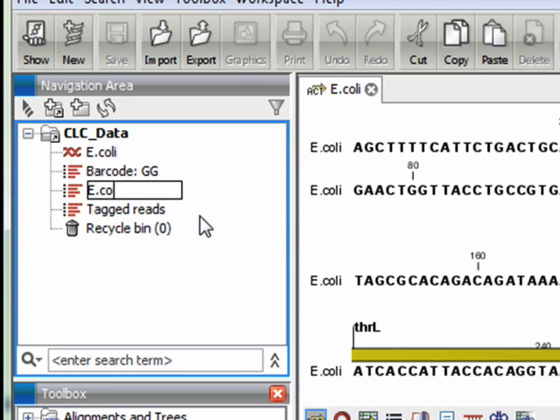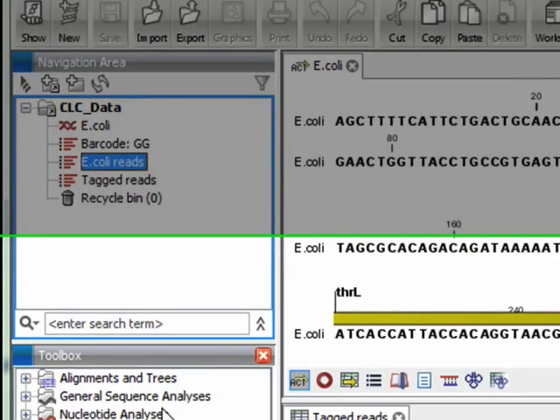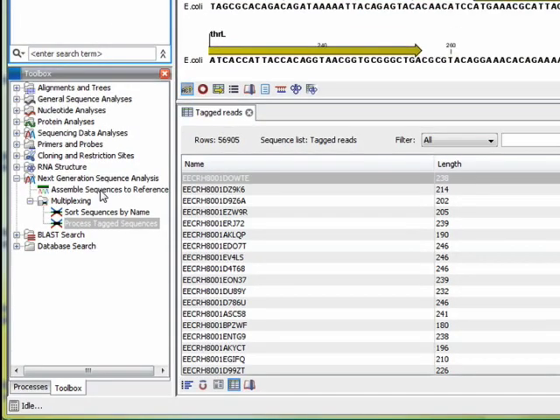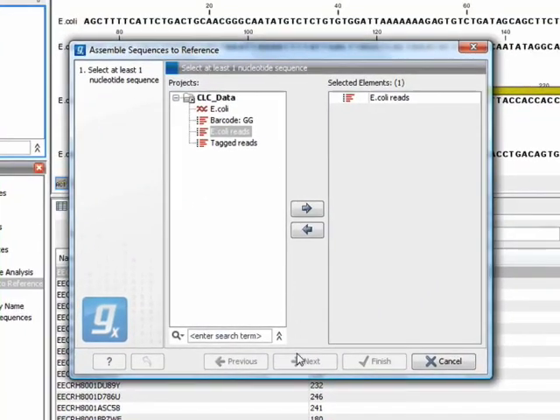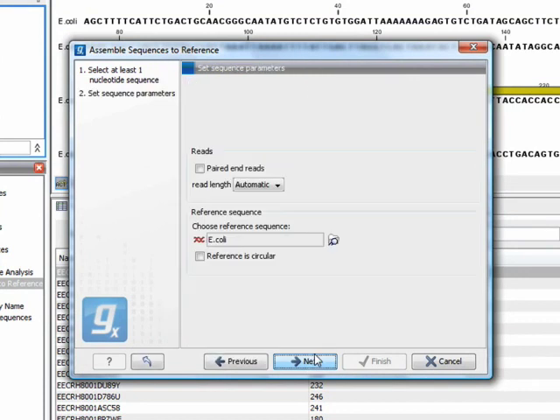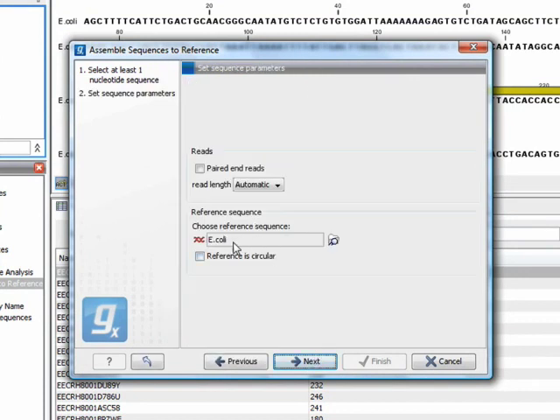Let's just rename that to E. coli reads. Alright, so what we'll do now is do reference assembly of the E. coli reads against the E. coli genome reference.